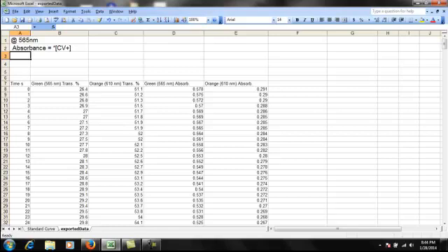Now, let me show you something. I'll write a couple things down here so I don't forget. At a wavelength of 565 nanometers, the equation of my line, which describes the absorbance, is y equals 30,109 times x. The important thing here is that this really means absorbance is equal to 30,109 times the concentration of crystal violet in the solution, because that is what x is. So that's what we found. So here's some data. I've got time recorded, and then I've got transmittance at the 2 different wavelengths, and absorbance.